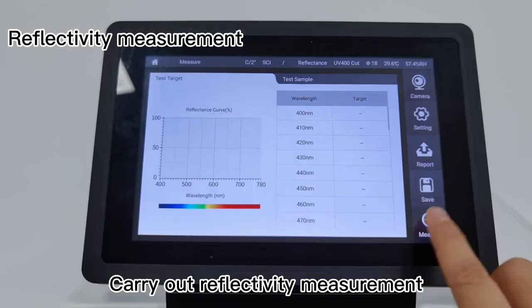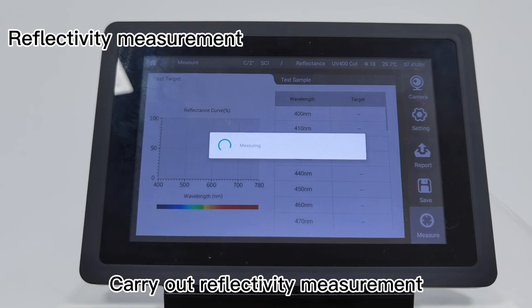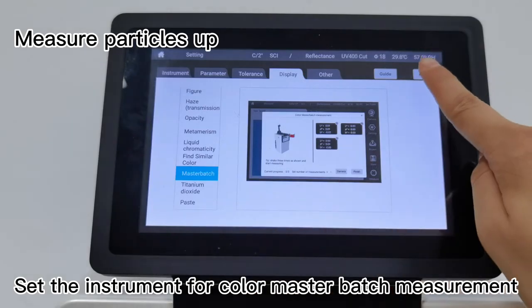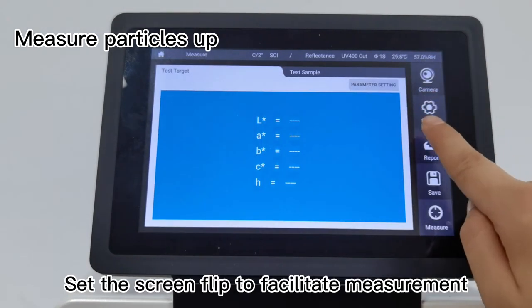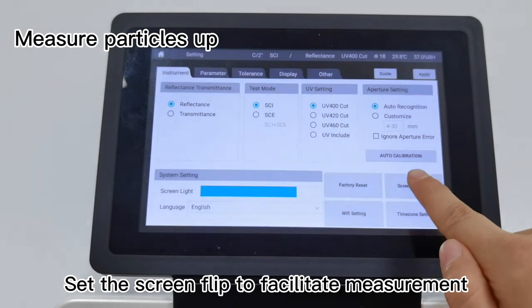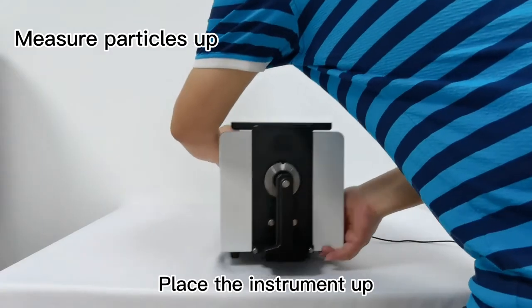Measure particles up: Set the instrument for color master batch measurement. Set the screen flip to facilitate measurement. Place the instrument up.